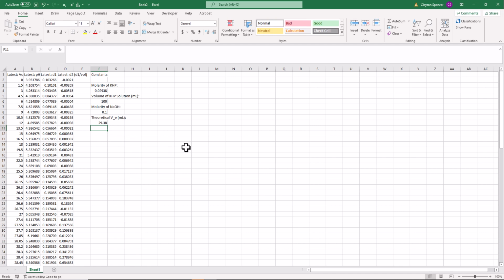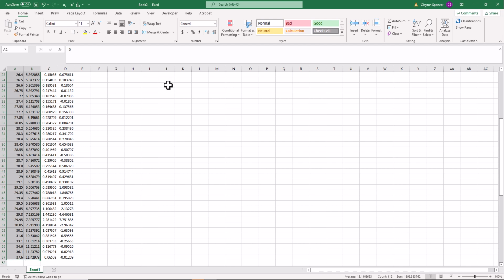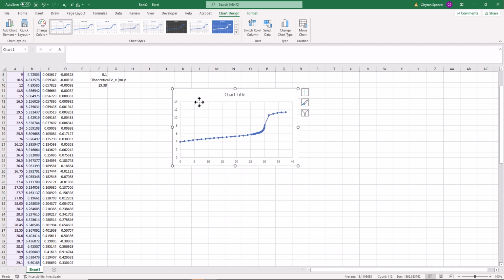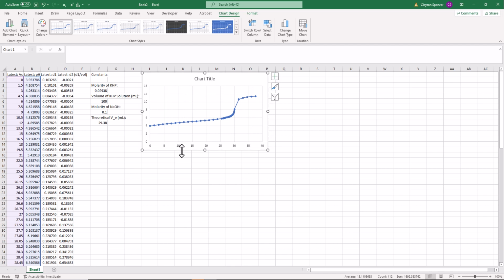All right, that's good. So the next thing that we should do is just make sure what our titration curve data looks like. So I'm going to do a quick plot of the titration curve. Remember, that's going to be a plot of volume of base, this first column, versus pH as our y variable. I'm just going to select these two columns of data, click and drag to do that, and insert an XY scatter plot. Let's connect the points with little line segments just so we can see what's going on. Let's move this up here. Okay, so here's our little plot.